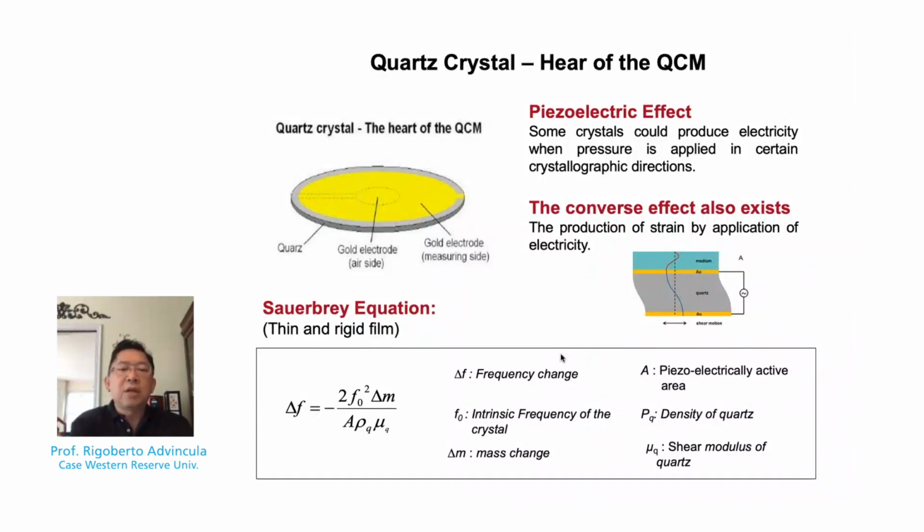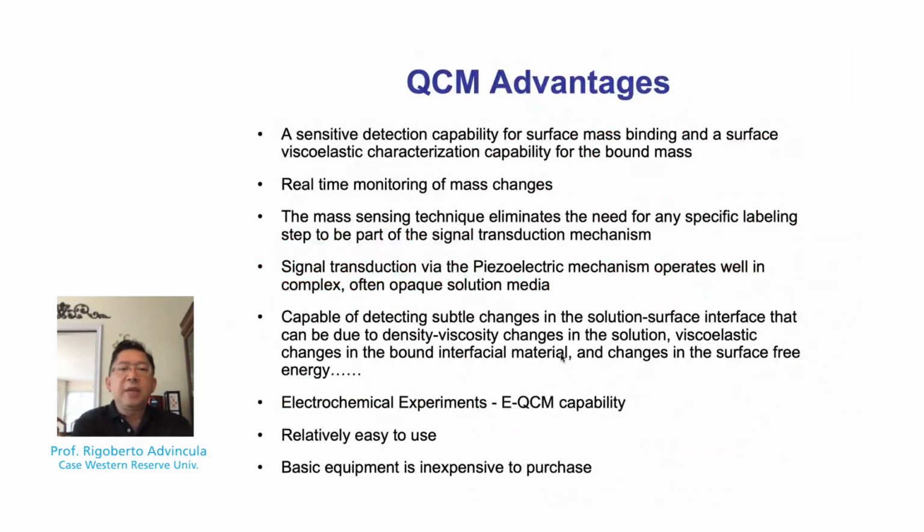Along with the advantages of sensitivity, QCM can be used to do what we call in situ or real-time monitoring. Also, as a mass sensing technique, this can be quite sensitive as a transducer mechanism or as a sensor for many types of surface events. And that means that the sensitivity of the piezoelectric media simply has to be corrected for the dielectric media or gas phase, or vacuum, to which it is exposed.